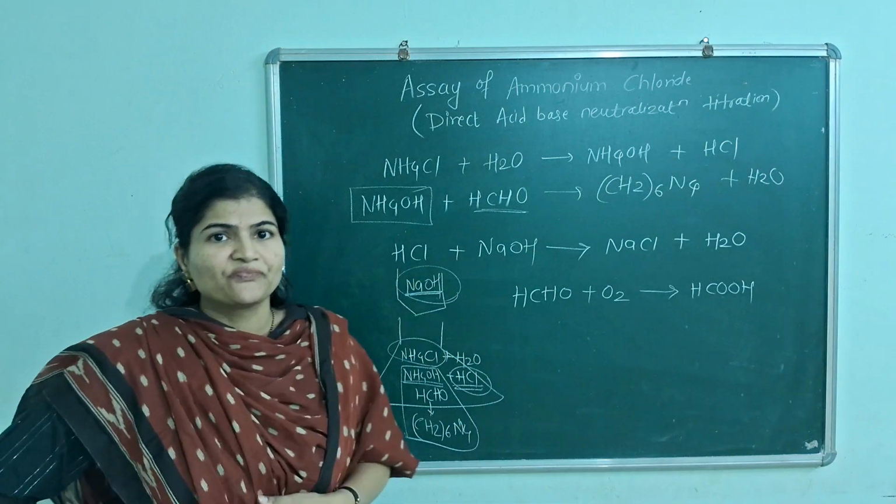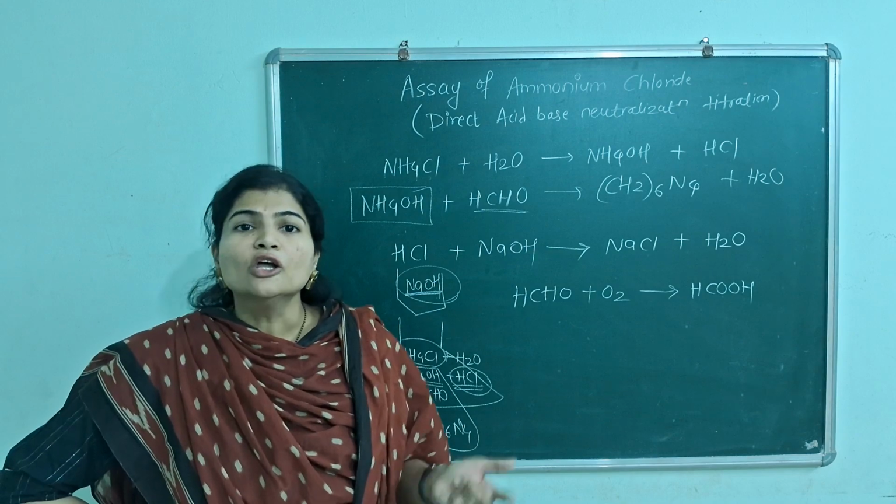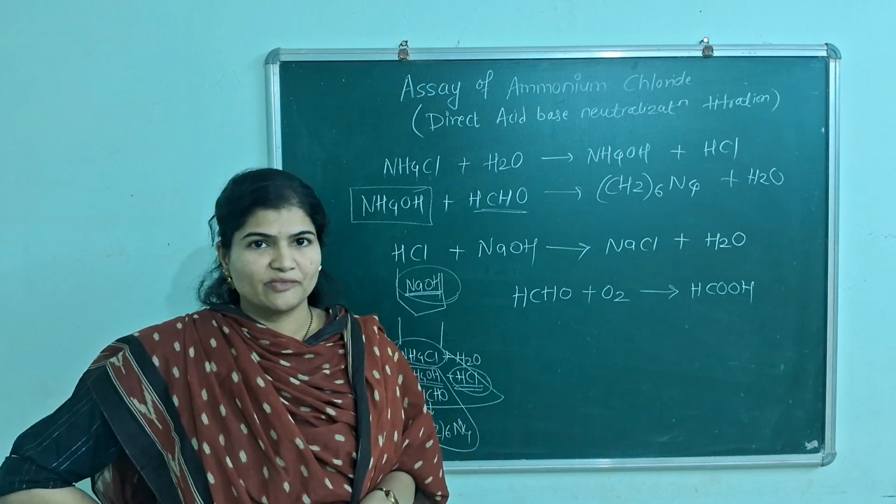This is the reaction. Now for calculations, you can go with the factor method or you can go with the milliequivalent method.